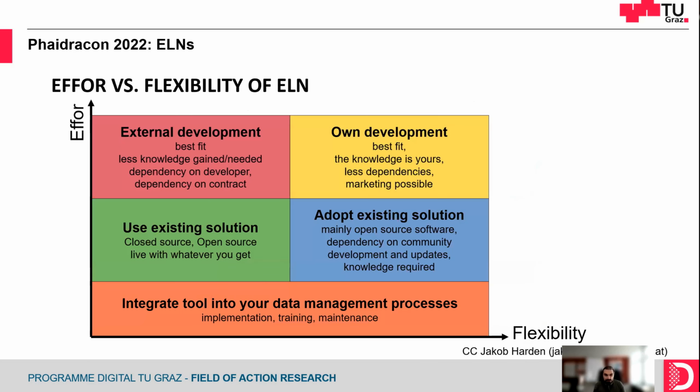So now I move on to these electronic laboratory notebooks. So why are they a key element of doing this metadata documentation? Because ELNs can be a way to document all of this stuff in a proper way that it can be shared and used, not as a paper laboratory book that has its limits, but here we can have more or less a hub where all of this information is coming together.